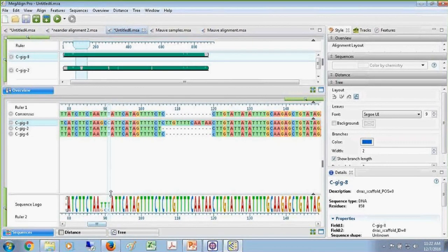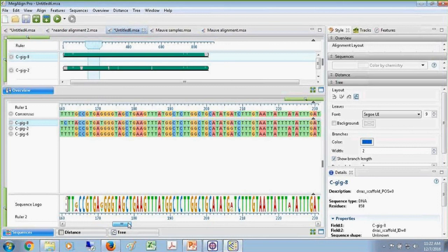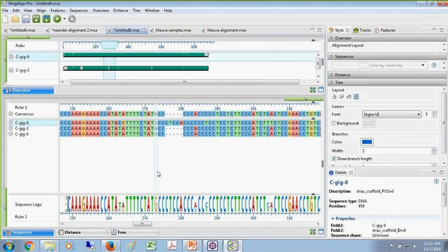And I used this exact method to identify the different progenitor genomes that existed in polyploids. I had to start somewhere, and this is the method I used. And I find the alignment worked really well just to get a bearing on it, an idea, get a count. This particular sample was an octoploid, and once I identified 4 distinct versions of the amplicon, I was able to, with some confidence, believe those were the different homologous reads, the different versions of the gene.